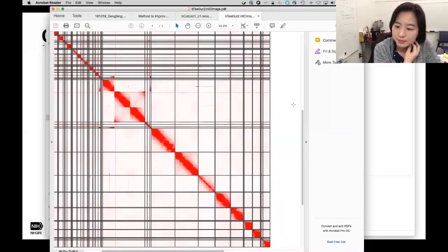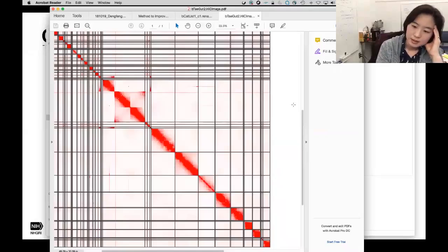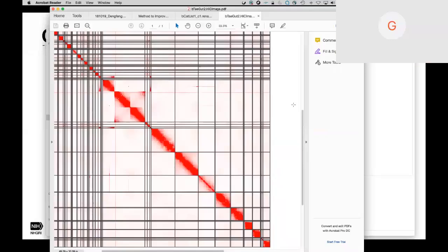I was wondering, is there any consideration that can be made about read orientation here? So if you were to color the reads by being properly oriented or not, do you think this would make sense? Or think about how the Hi-C library generation is carried out? I think it wasn't so easy, but yeah, I'll think about that too.